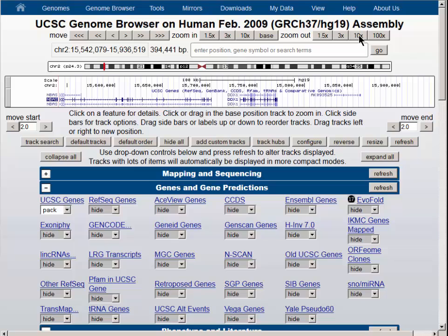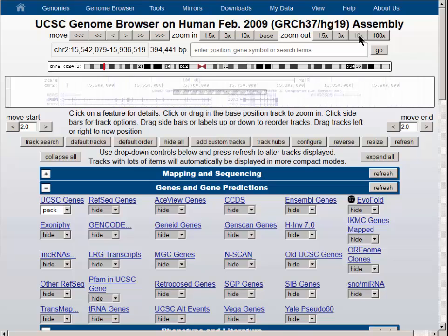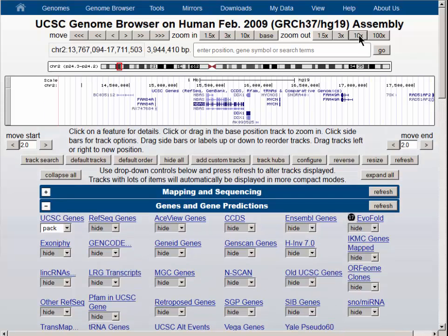Let's zoom out by a factor of 10 now. We will get a number of other genes onto the screen. We will use this region for our inquiry using the table browser.